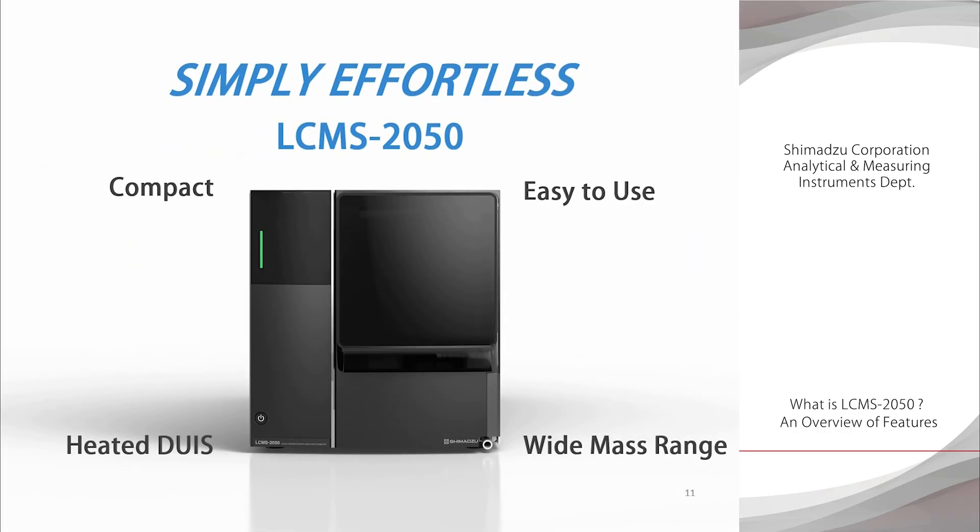The LC-MS 2050 is a compact but easy-to-use, high-performance model. With the LC-MS 2050, the world of mass spectrometry awaits.